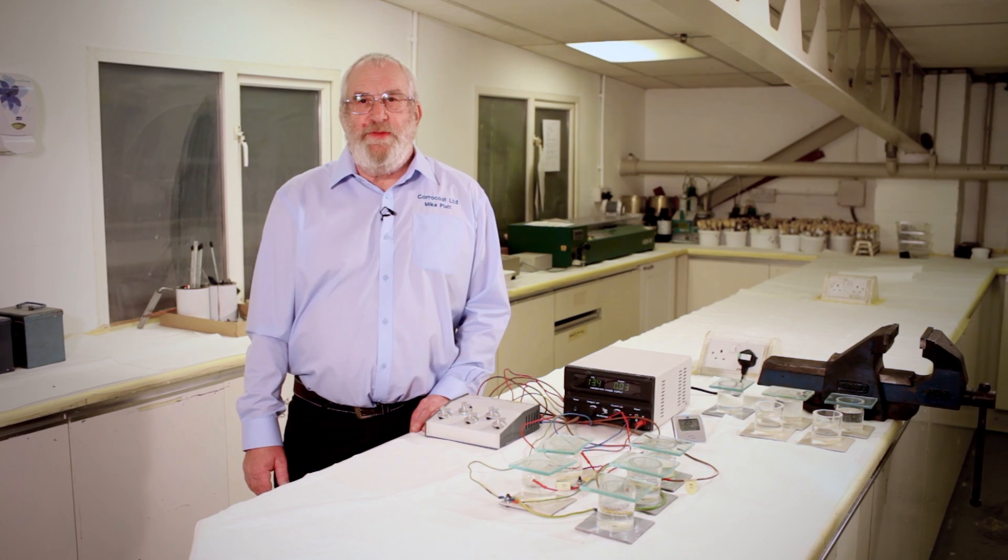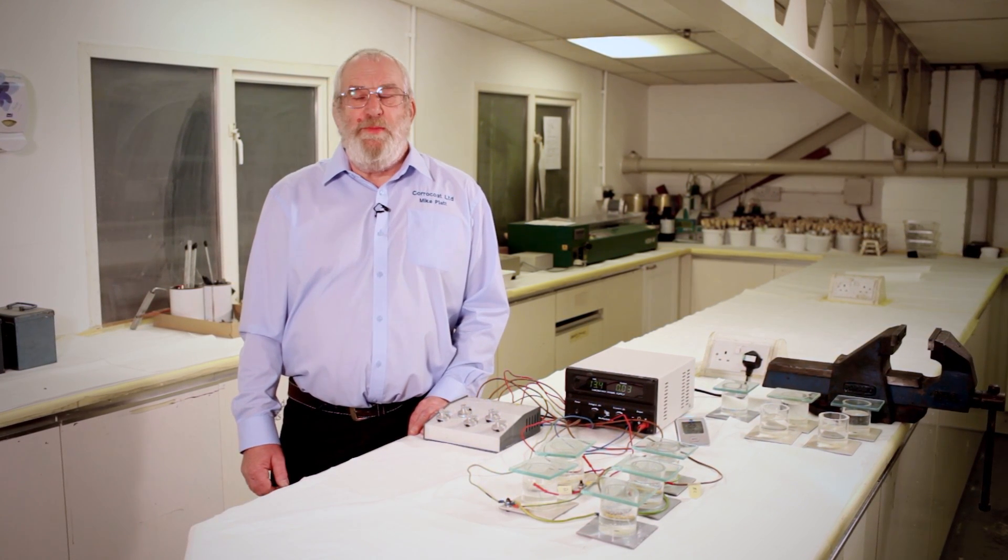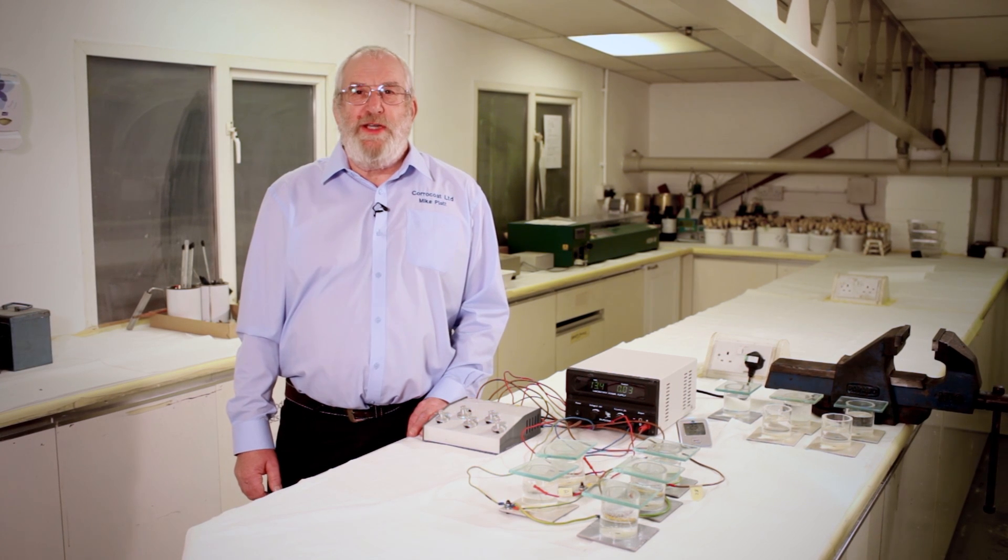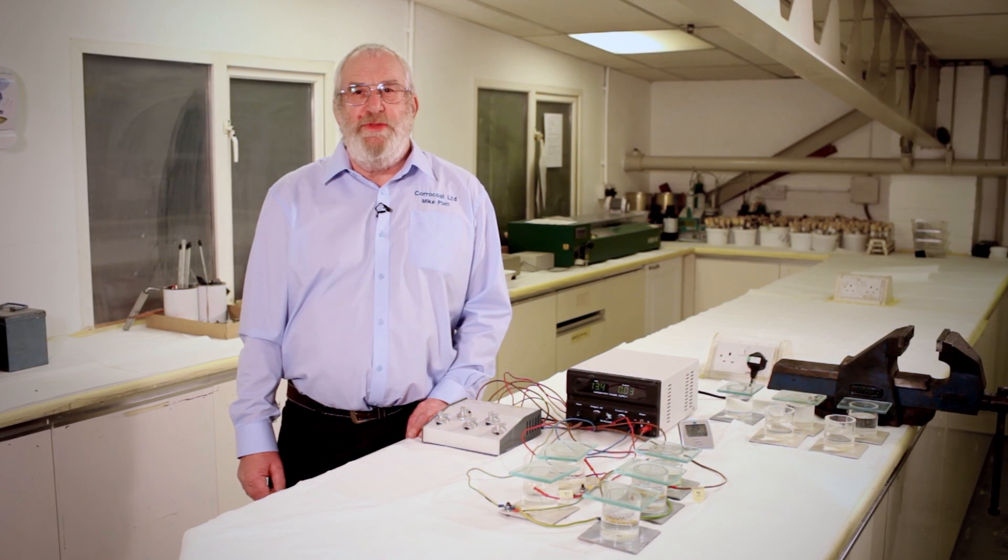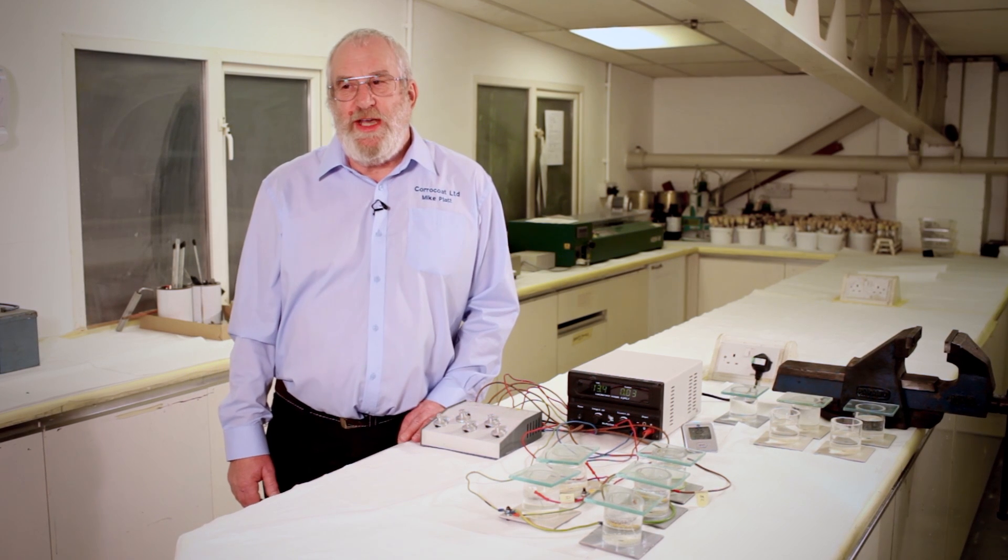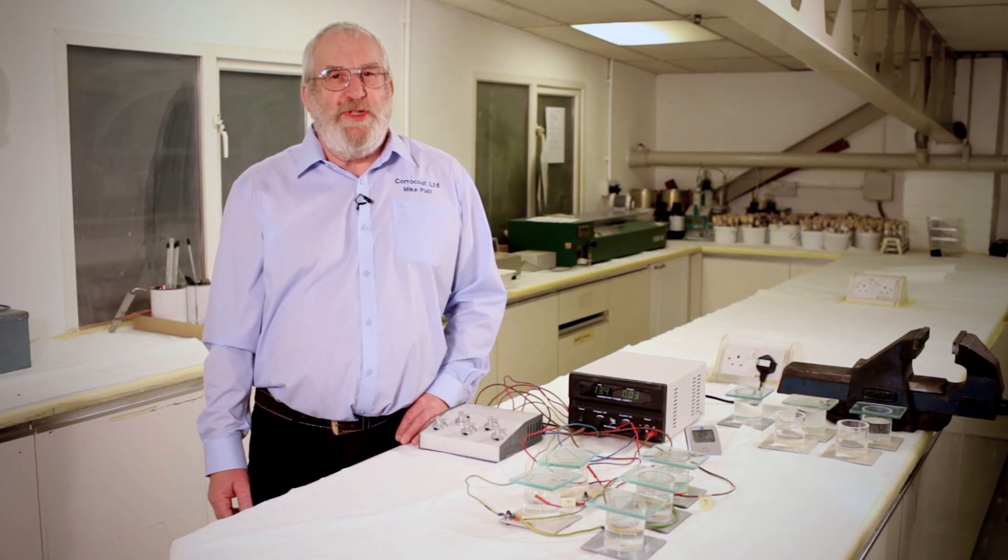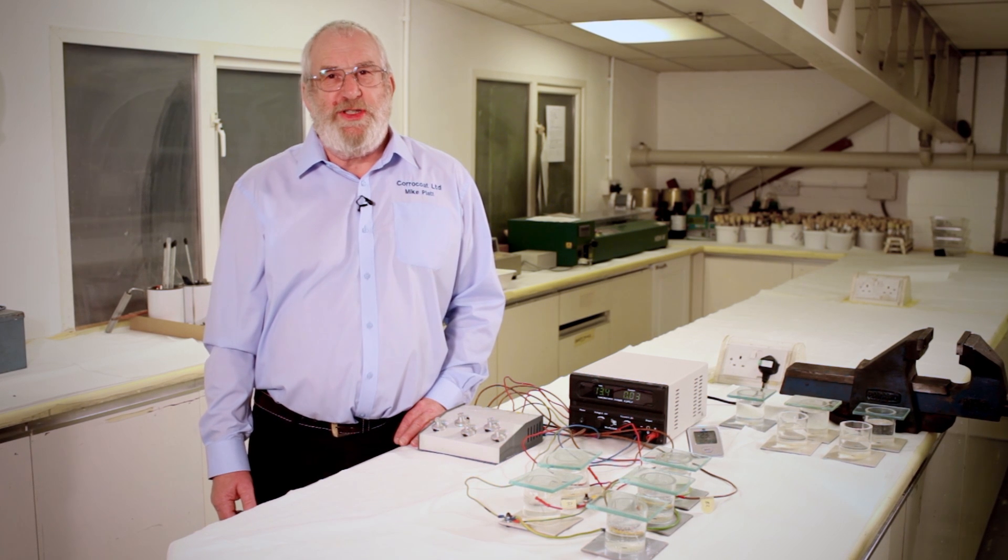Several tests for cathodic disbondment have been promulgated over the years. But the one we prefer at Coracoat is the most aggressive, can be carried out quickly and gives accurate, repeatable and consistent results. It's a sort of sorting men from the boys test. The downside is that the area of disbondment is sometimes difficult to ascertain.